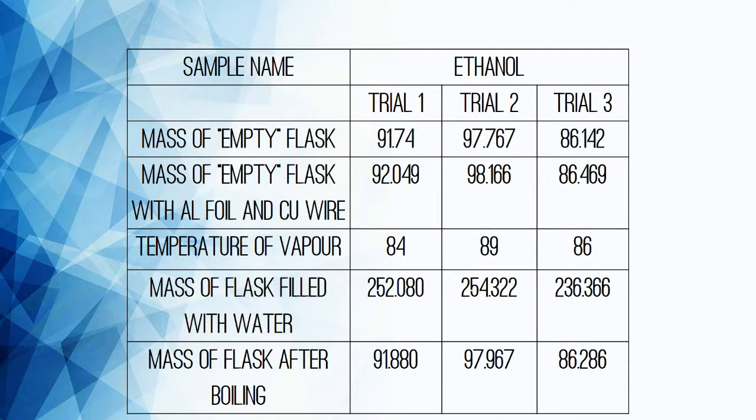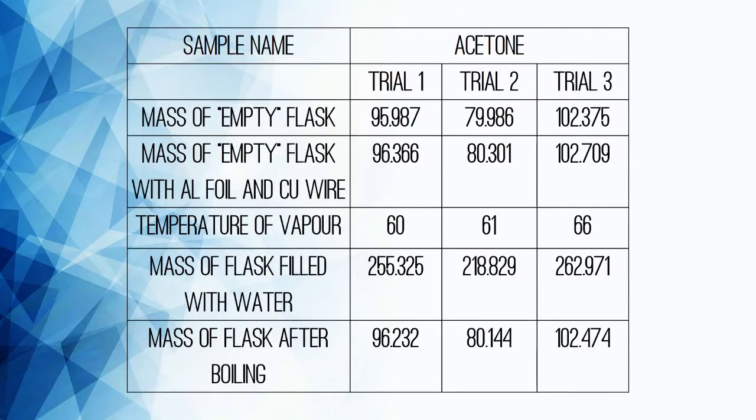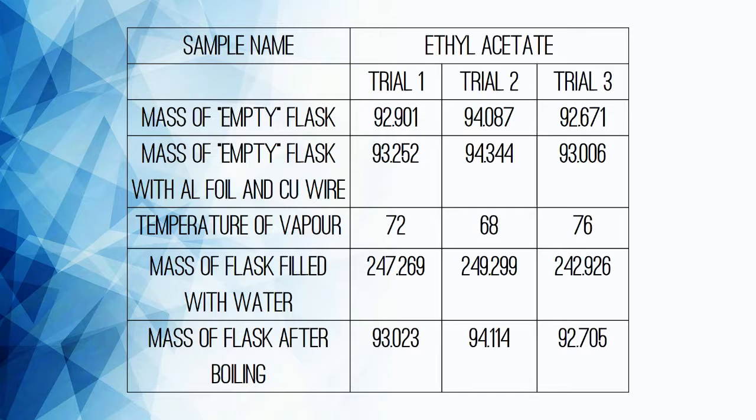After the data has been treated, here are the results of the experiment using ethanol, acetone, and ethyl acetate as the liquid samples.